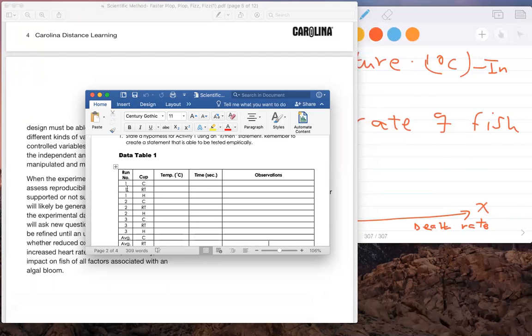You will split a tablet into 2. Follow the directions on how to split it equally.